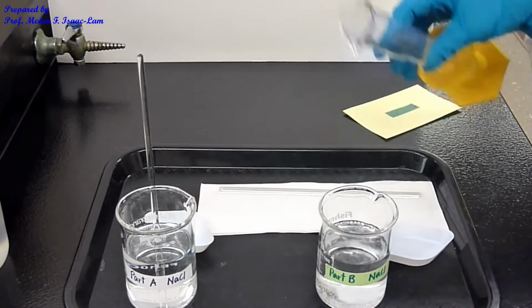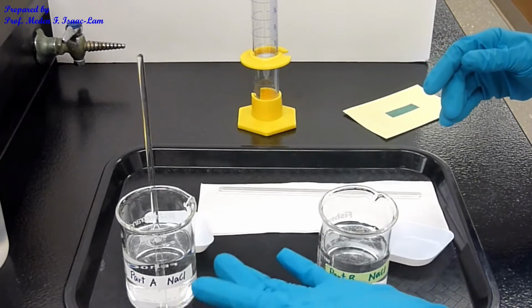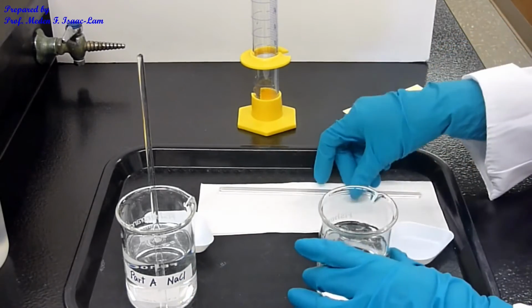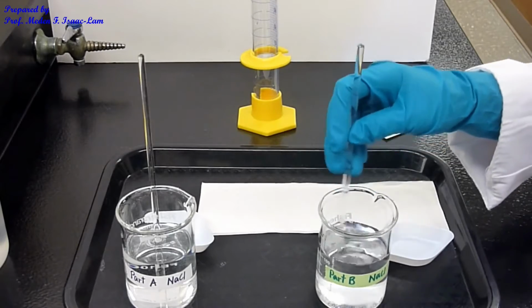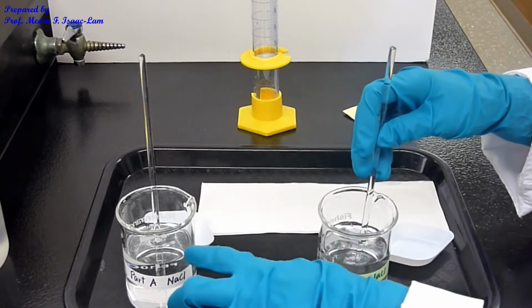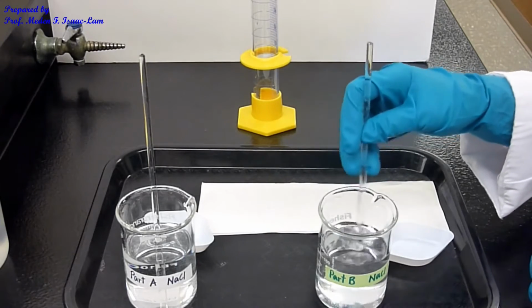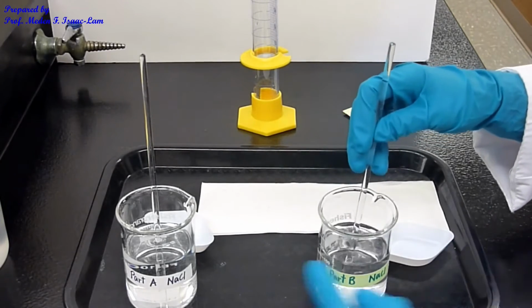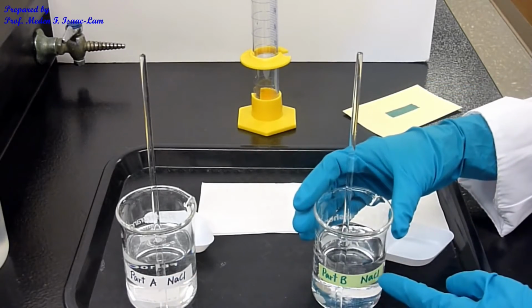Remember for part A, I weighed 5.845 grams, and this one I only weighed 0.900 grams of NaCl. And it should dissolve too, right? This one has more weight, this one has less weight. That means this part A solution is more concentrated than the part B solution.